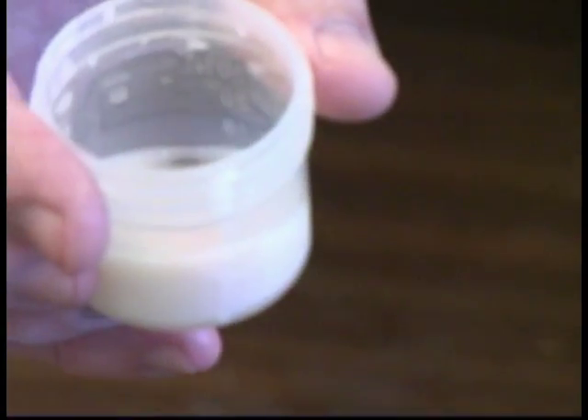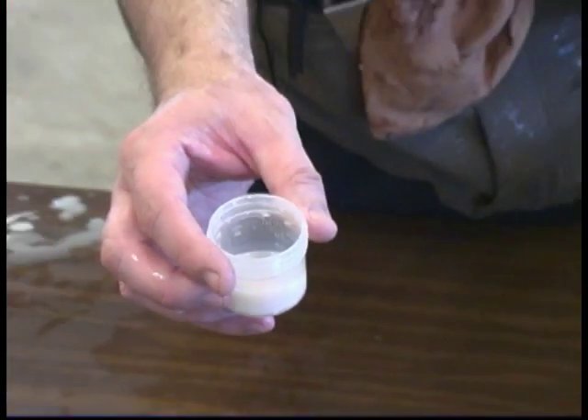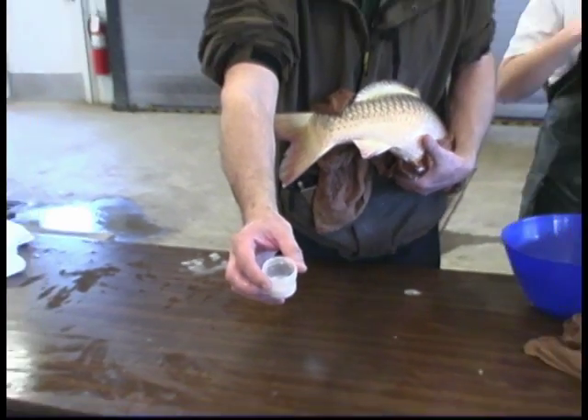Usually, the last portion of sperm is also accompanied by a small amount of blood. This indicates that stripping is already finished.